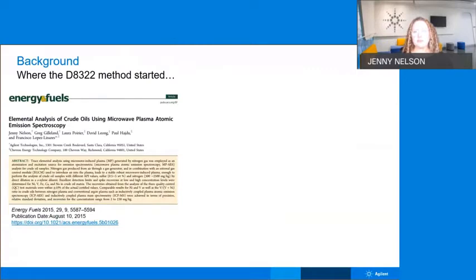So I wanted to give you a little bit of background on how this method started. So it was probably about 6 years ago, in about 2014, that I was working with our collaborators at Chevron, and we were talking about this new wonderful technology that Agilent came out with, the MPAES. And they were very interested in learning more about it and maybe doing a study to see how well this instrument could perform with their very difficult samples.